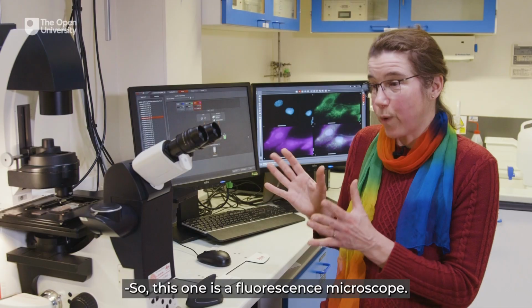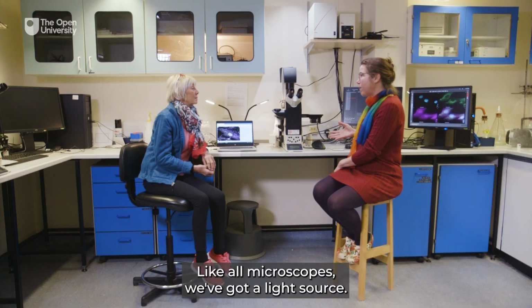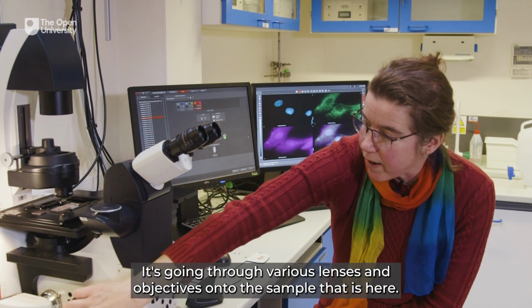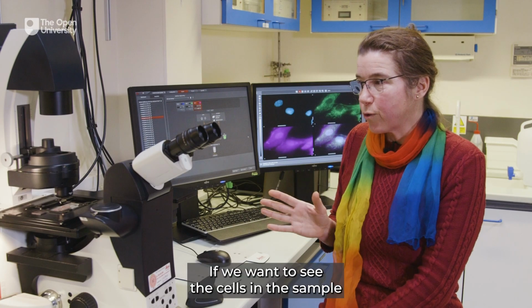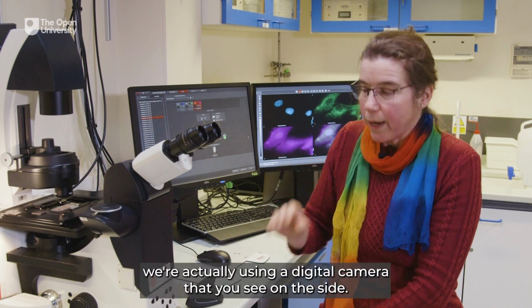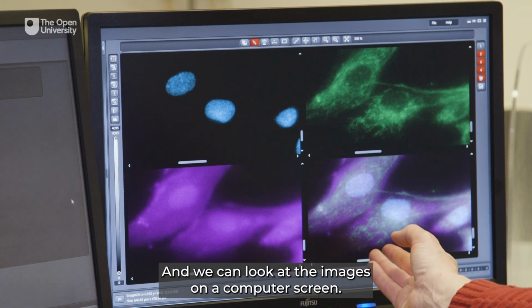This one is a fluorescence microscope, and actually it's the fluorescent microscope we used to take a lot of the images that went into the digital fluorescent microscope. Like all microscopes, we've got a light source. The light is going through one of these cables into the microscope, through various lenses and objectives onto the sample that is here. If I want to see the cells in the sample, I can either use the eyepieces, but most of the time we're actually using a digital camera on the side that is feeding the images to a computer, and we can look at the images on a computer screen.